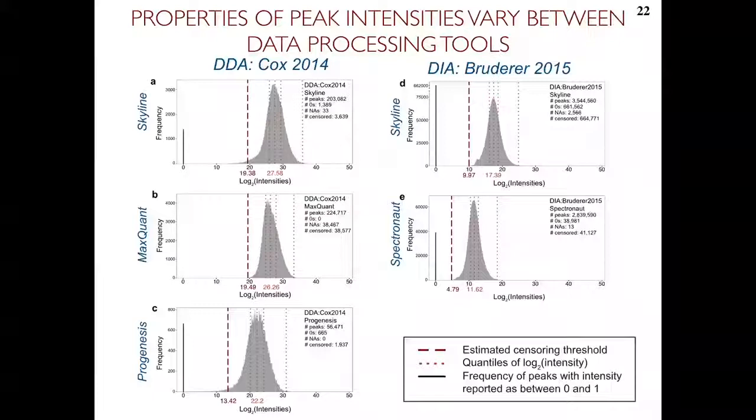Because they have sometimes different purposes, sometimes are developed on different data sets, sometimes the developers have a certain vision and certain problems are most important to them, right? But all of that should not really affect our biology too much. We should be able to use different tools, which are all reasonable and validated, and get the same type of biological conclusion in the end. And it didn't quite happen that way.